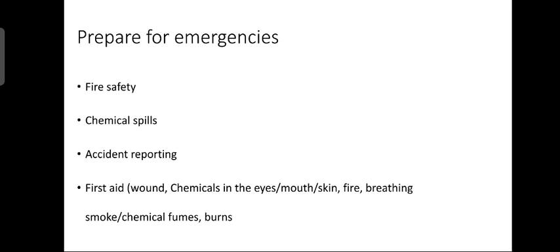Okay. Now next let us see chemicals in the mouth. This kind of accident is usually unlikely. However, if it does happen, any chemical taken into the mouth should be spat out and the mouth rinsed thoroughly with water. Many chemicals are poisonous to varying degrees.